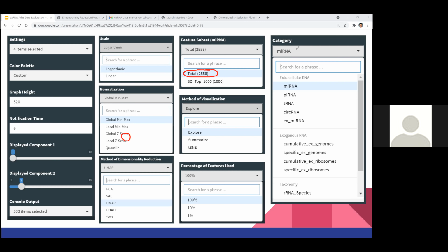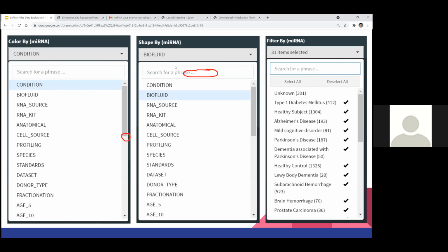Justin, go to the next slide. He has done the dimensionality reduction on all the data, and you can filter with respect to the metadata. So using all the data, the dimensionality reduction is done, and you could display the data sets for a subset of the experimental techniques. Maybe you filter on the metadata in terms of what you want to visualize. Perhaps it will be useful to demonstrate it as well.